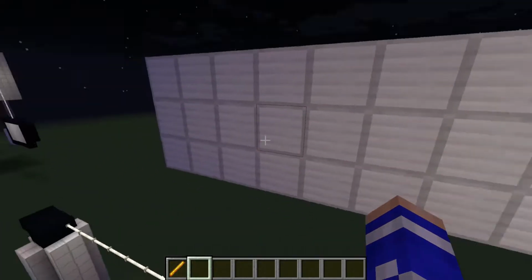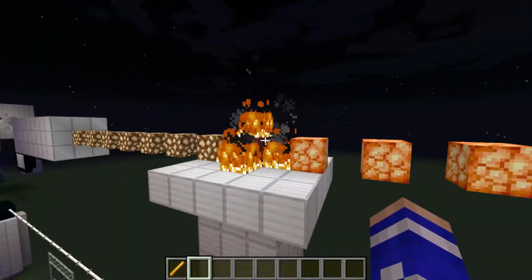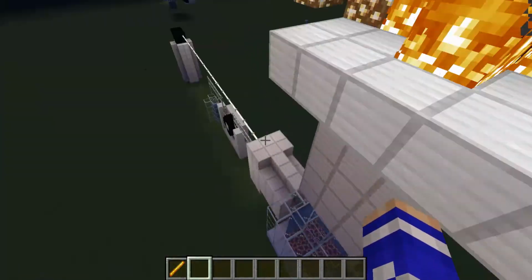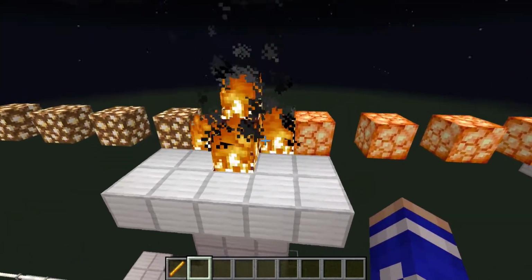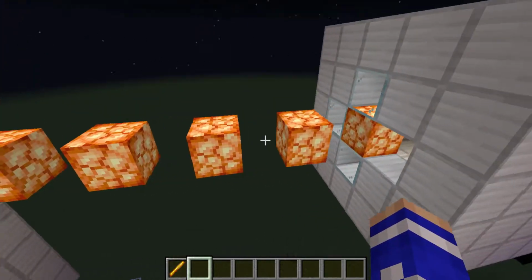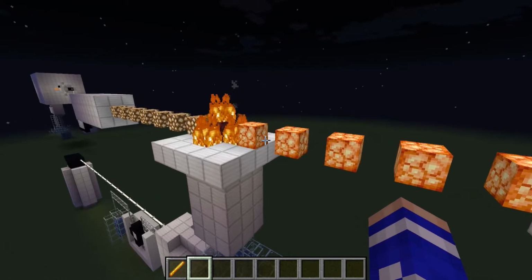And how we ignite it is we use an RF generator which sends particles in here. This will ignite the plasma, which has all of our elements in it. All the elements present in the sample will be ignited here, and that's one of the biggest differences, that we can look at several elements at the same time. And so this plasma will emit light, and that's another big thing, looking at emission instead of absorption.